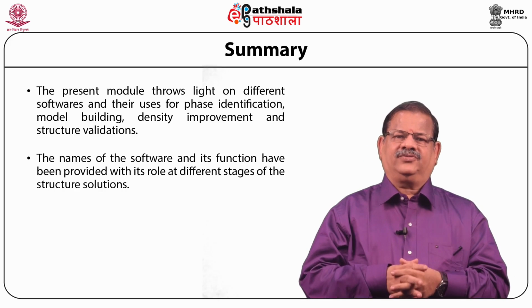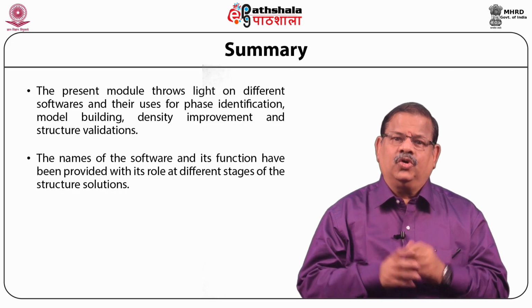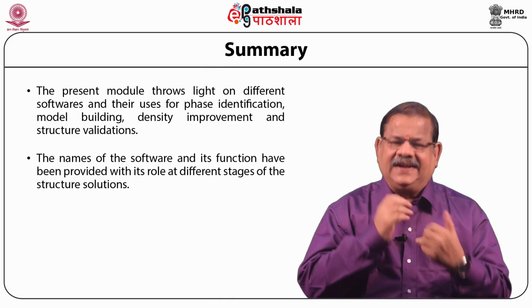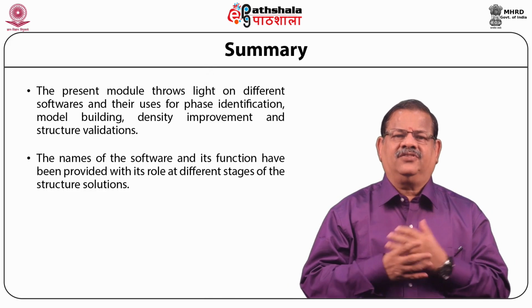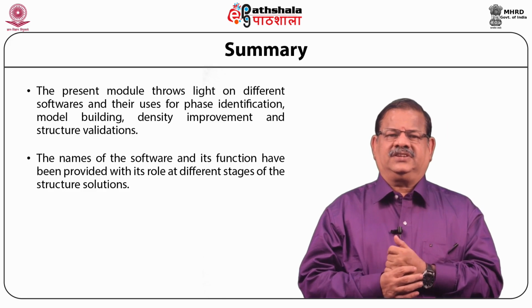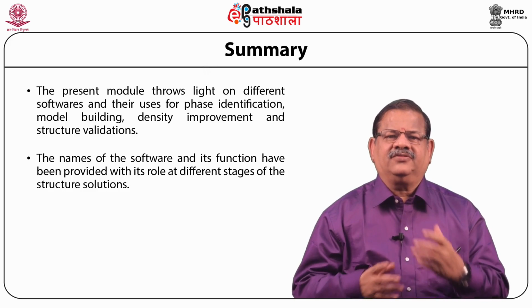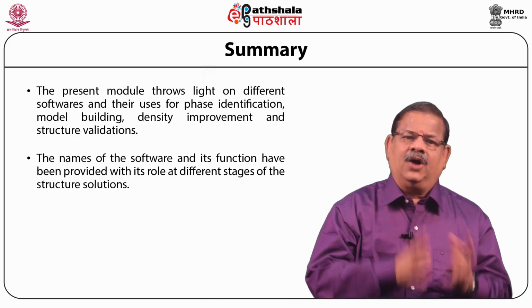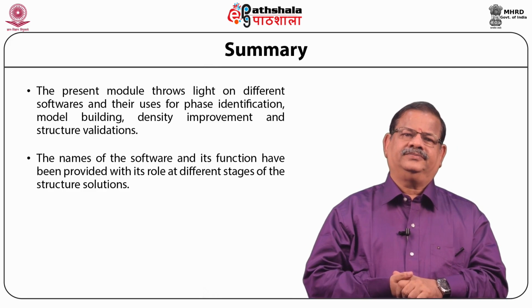The names of the software and their function have also been provided with their role at different stages of structure solution, starting from data reduction and applying the thermal factor corrections, calculation of normalized structure factors, E values, then rotation function, translation function, the molecular replacement techniques by various programs, then your starting phases from your solve program, and how these phases can be used for phase extension and modification and so on.